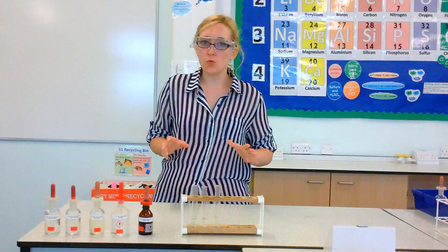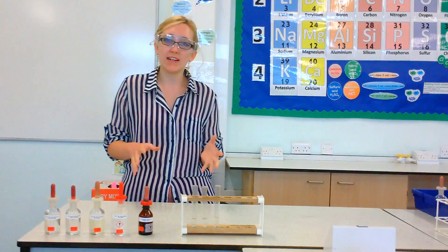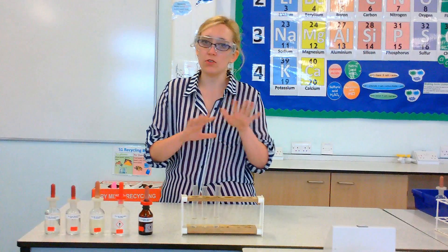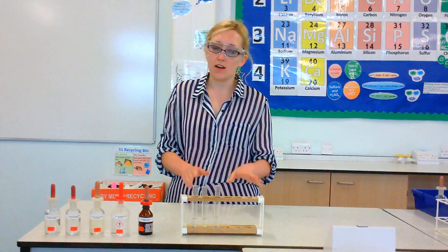Hello everyone. In this video we're going to be performing a test to find out if we've got any halide ions present in our solution. These are all negative, so we're looking for negative halide ions.